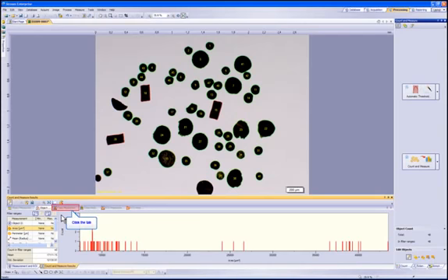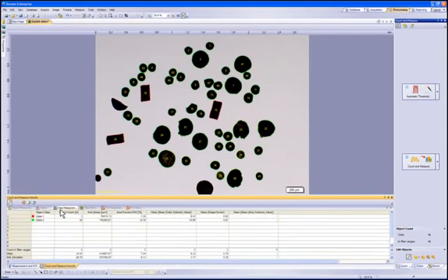The next window will show the class measurements we set up. This provides details on individual classes. Class 1 is set up based on a mean shape factor. This allows the particles that are rectangular in shape to be in Class 1 and the round particles in Class 2. We can show the object count for each class along with any measurement value we would like.